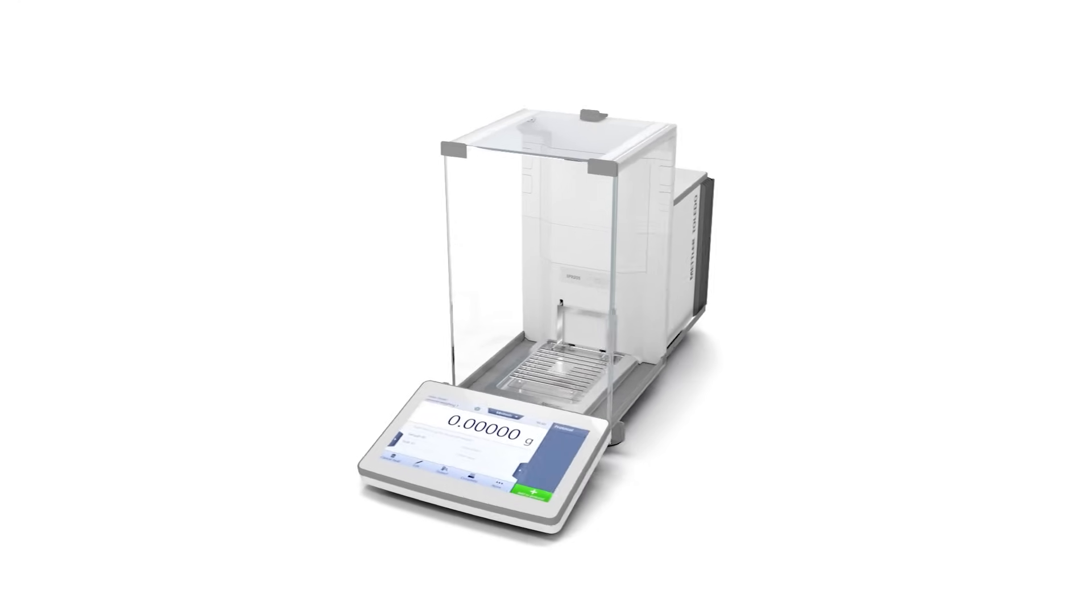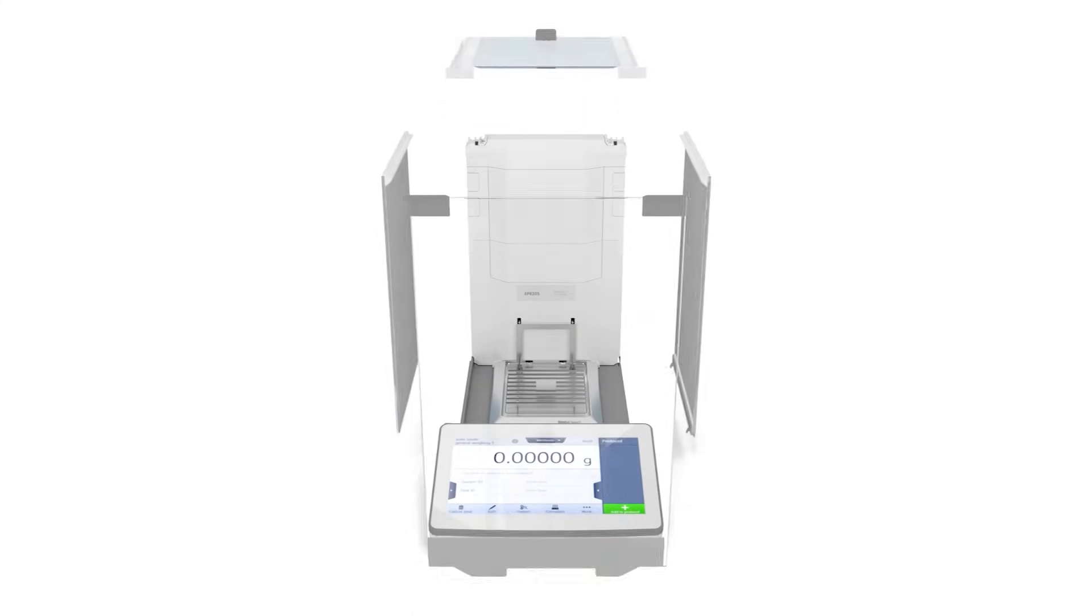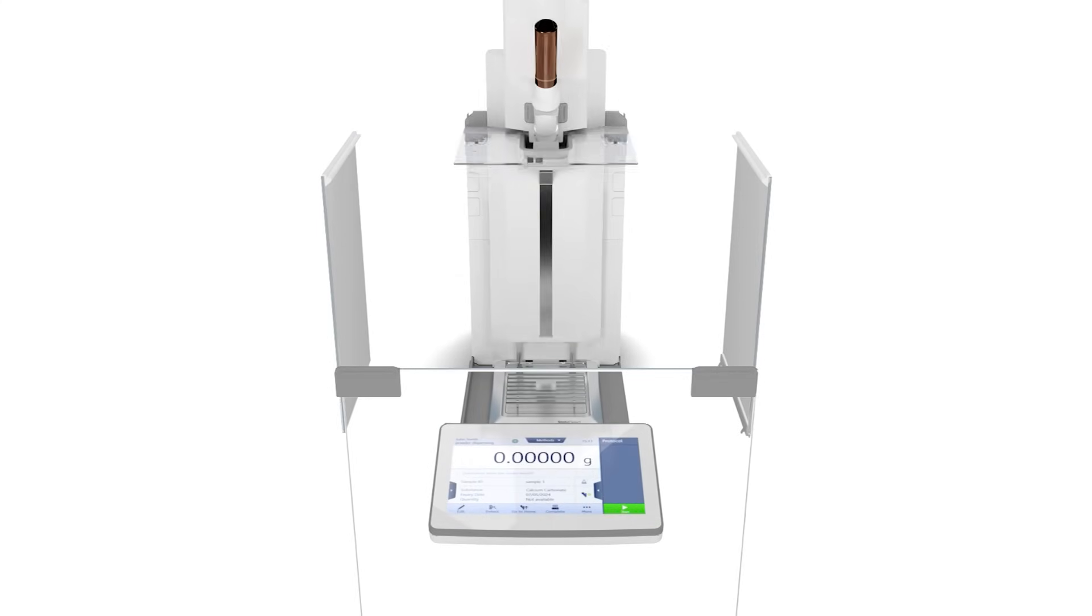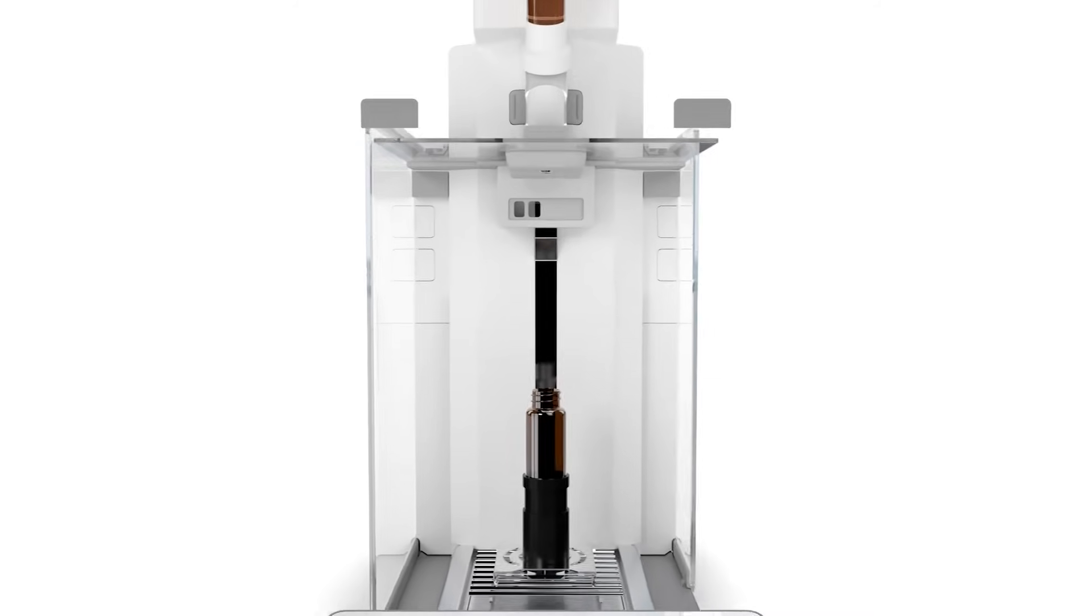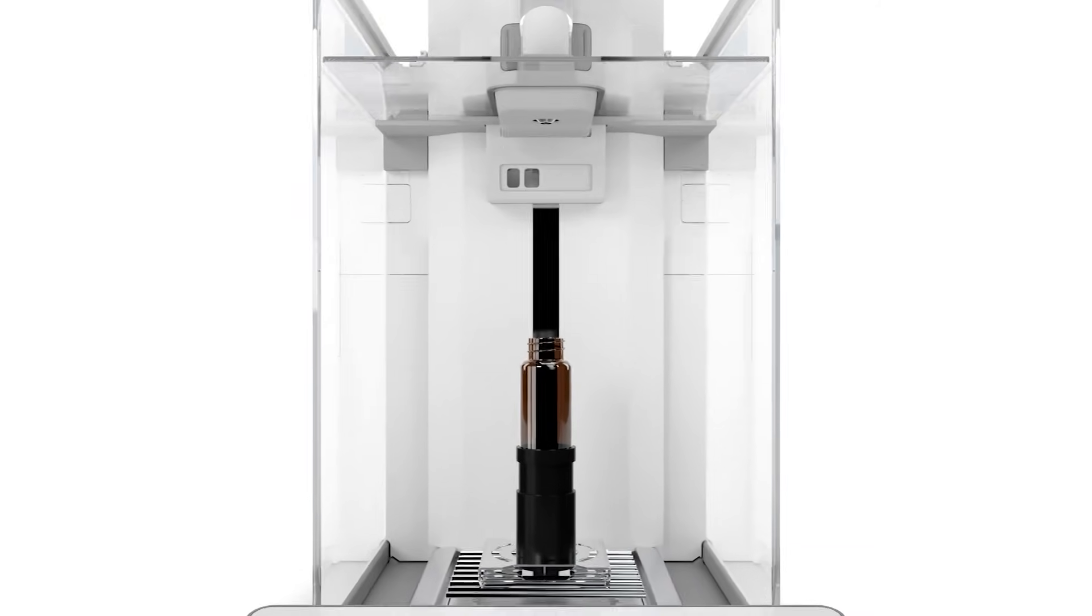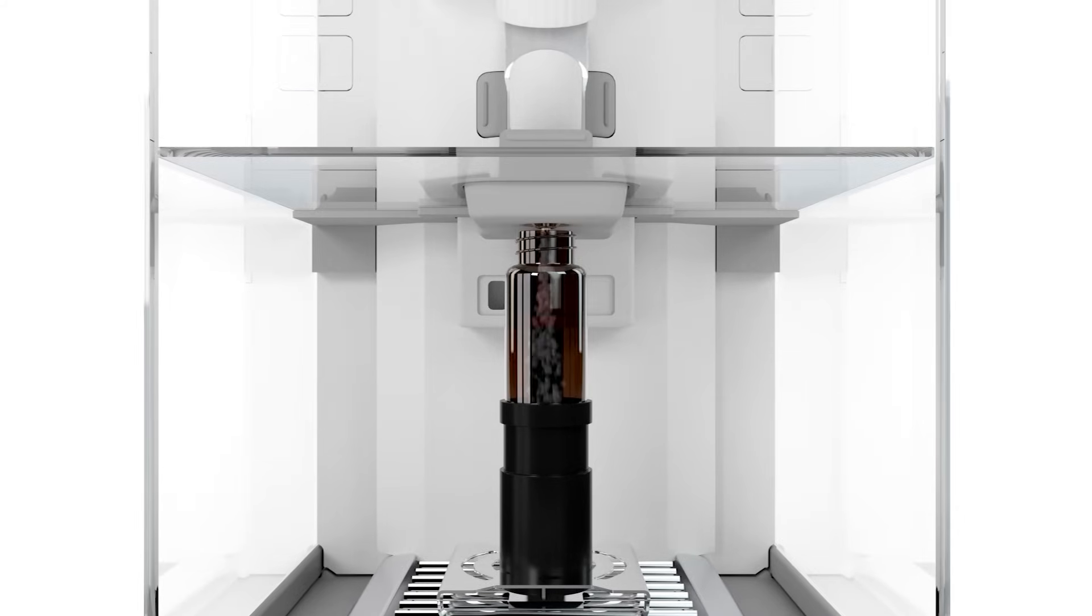But innovation doesn't stop here. At Mettler Toledo, we have gone one step further and future-proofed the XPR. With an additional module, you can upgrade to automatic dosing of powders or liquids anytime.